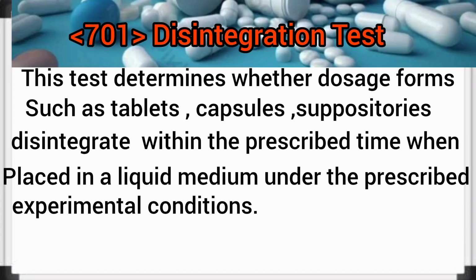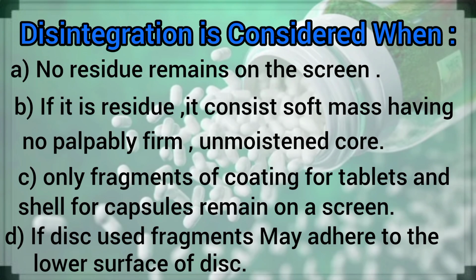Disintegration test. This test determines whether dosage forms such as tablets, capsules, suppositories disintegrate within the prescribed time when placed in a liquid medium under the prescribed experimental conditions. Disintegration is considered when A.